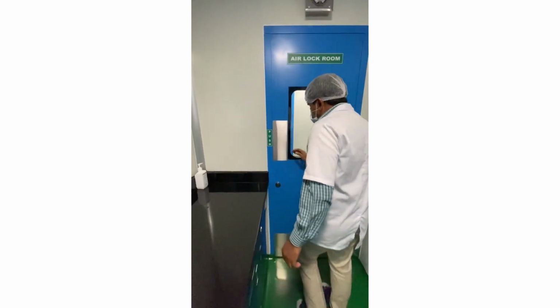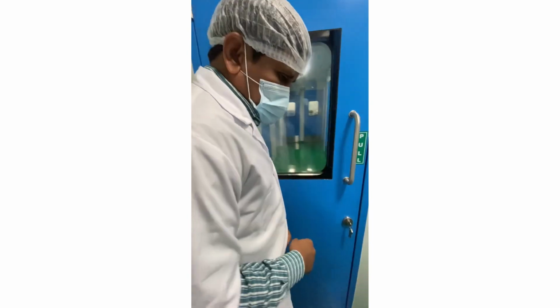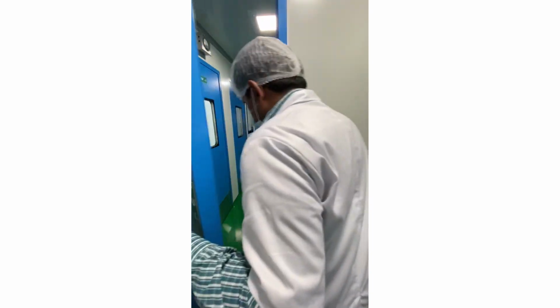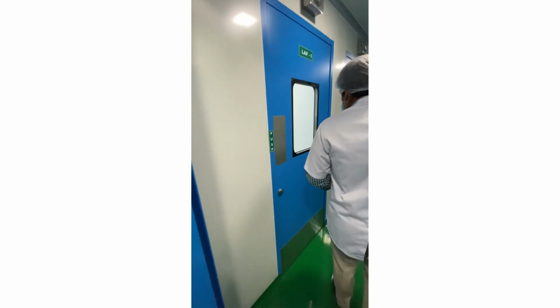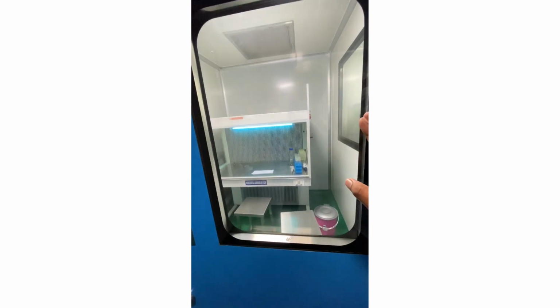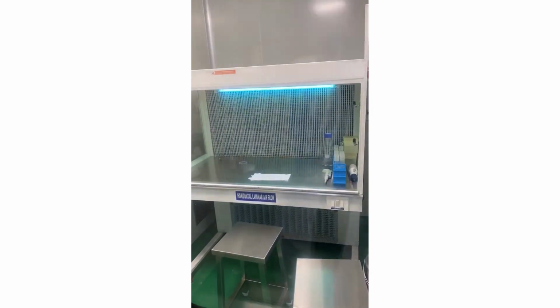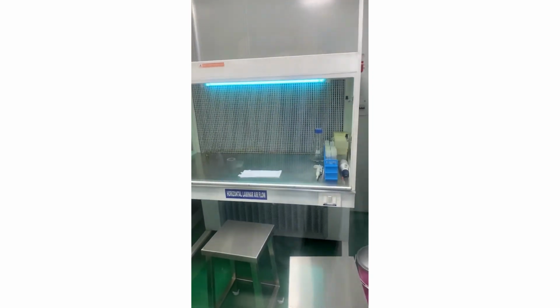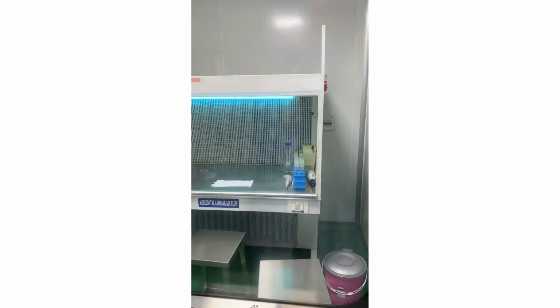This is the airlock room. This is the laminar airflow chamber. This is the heart of the microbiology department. By this chamber only, we are performing the analysis. Here we are taking the samples through the pass box and performing the analysis in this room.